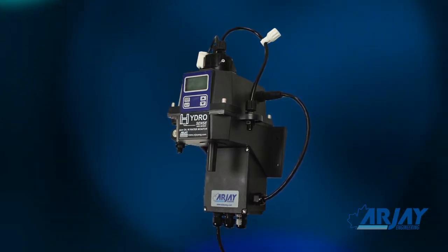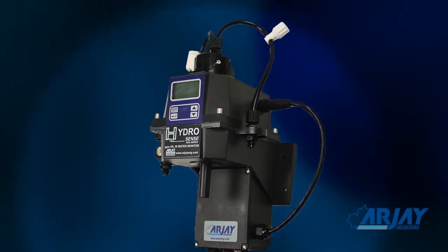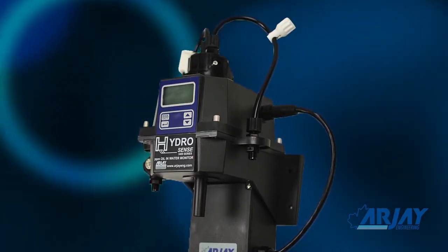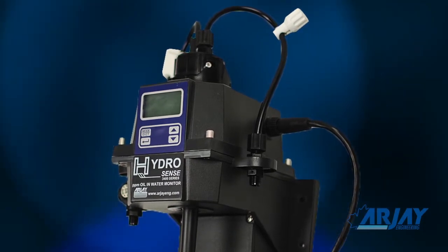Maintenance is even easier. Routine cleaning will be necessary at a frequency determined by your site conditions. The power and flow does not need to be turned off. In fact, it is best not to. Also, no tools are required.